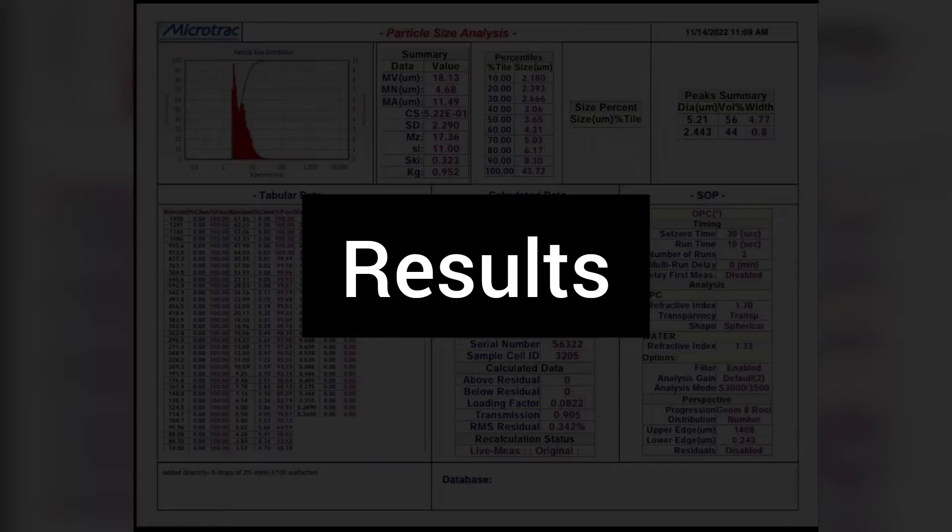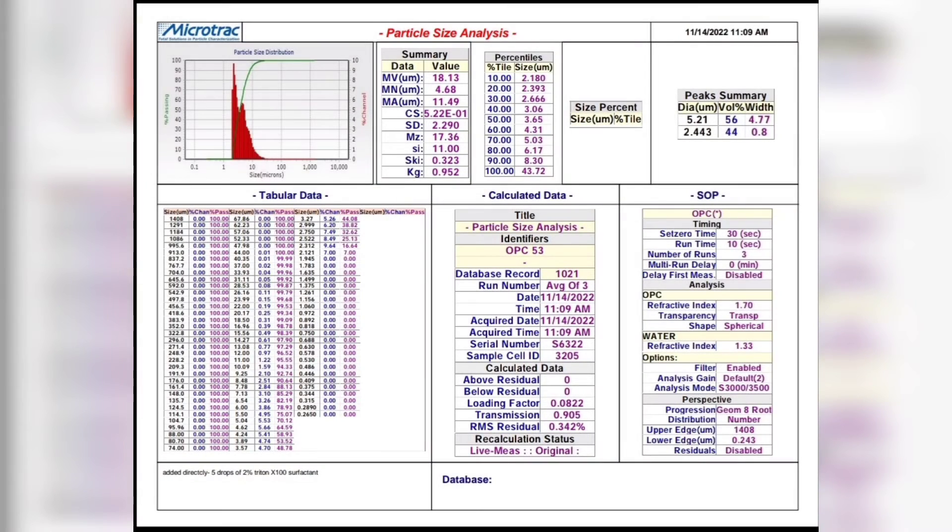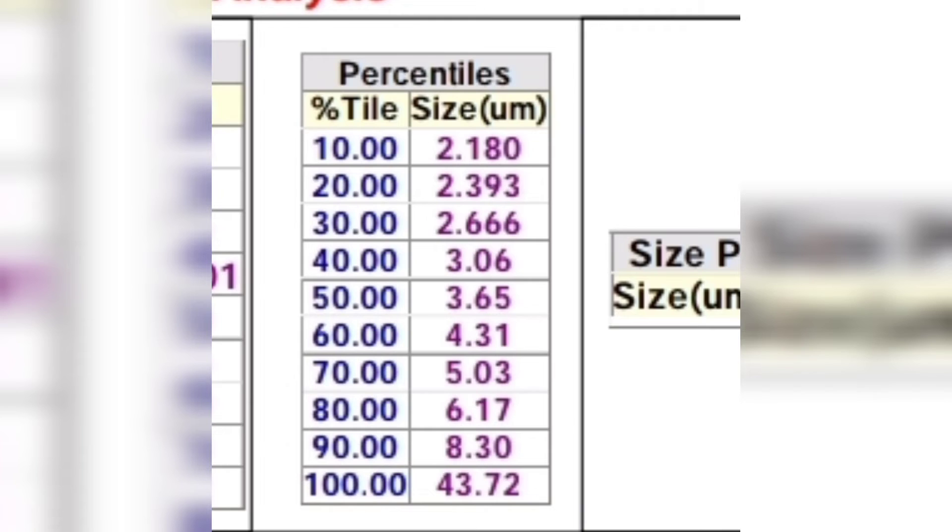It takes approximately 30 to 60 seconds for the analyzer for each run, and it gives three individual reports and one average report. We will be discussing the average report of the OPC-53 cement sample.